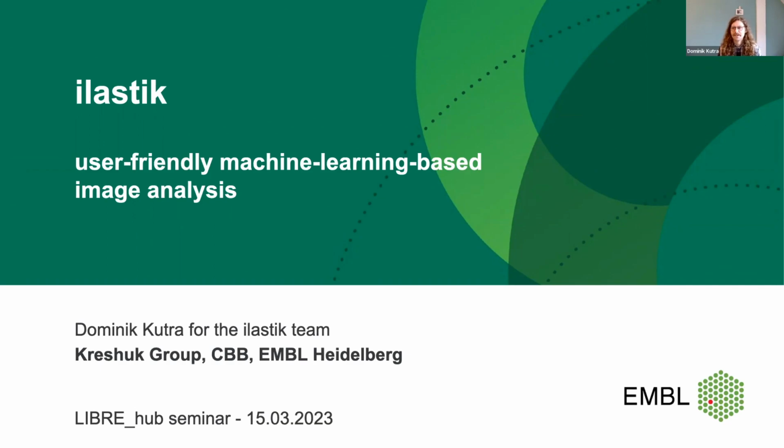I work as a software developer in Anna Kreshuk's lab at the EMBL in Heidelberg. I work with her for 5 years now. And what we are developing in this lab is a software tool that is called Ilastik, which claims to be a user-friendly machine learning-based image analysis tool. And of course, this tool is open source. I'm a little bit of an open source enthusiast. And that's why I'm doubly happy to be presenting in this forum where other open source enthusiasts are also.